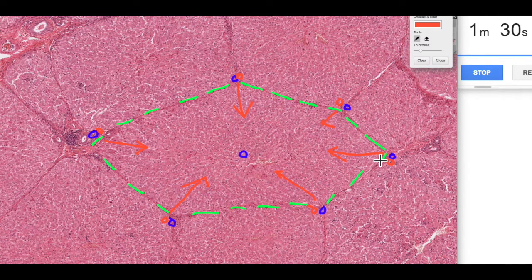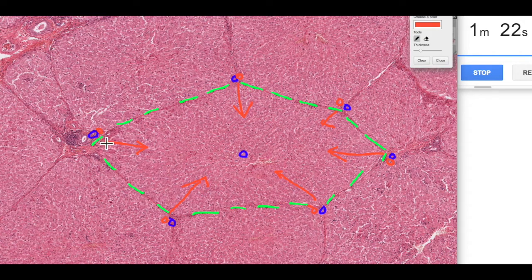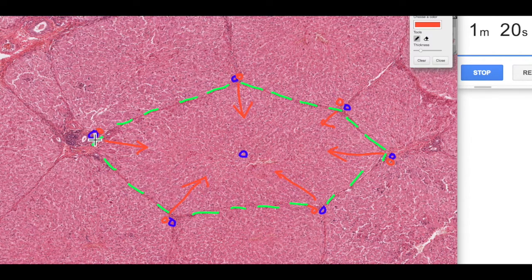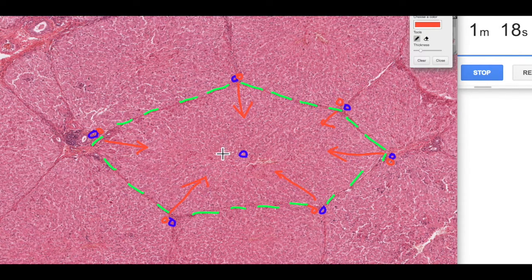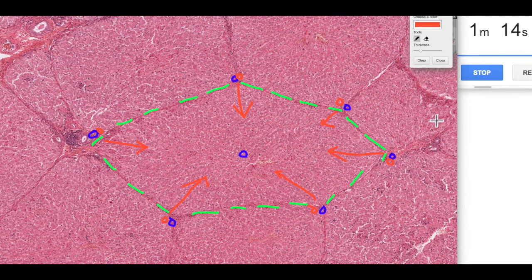So this is our classic lobule structure, the typical histologist way of thinking about the liver. The idea of the hexagon with the portal regions, with our dual blood supply, with the dual blood actually coalescing and then draining into this central vein. This is the classic liver lobule structure, and I hope you found that useful.